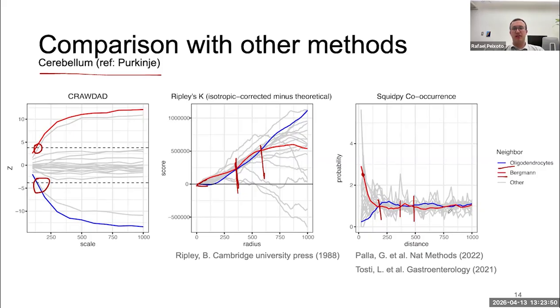I think it is just a definition of the neighborhood. So here you're using an annulus region for the neighborhood, and that can change a lot of your results. But depending on the analysis you're trying to do, this might be the most suitable method.